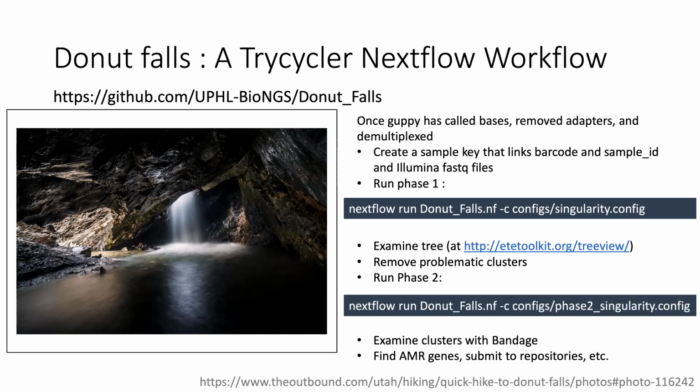There is an intermission in between, in which the end user is required to look at the sequences and things. Right now, the workflow isn't complete. If you would like to help me test it out and add features, that would be great. It is on GitHub, and I would love collaboration.